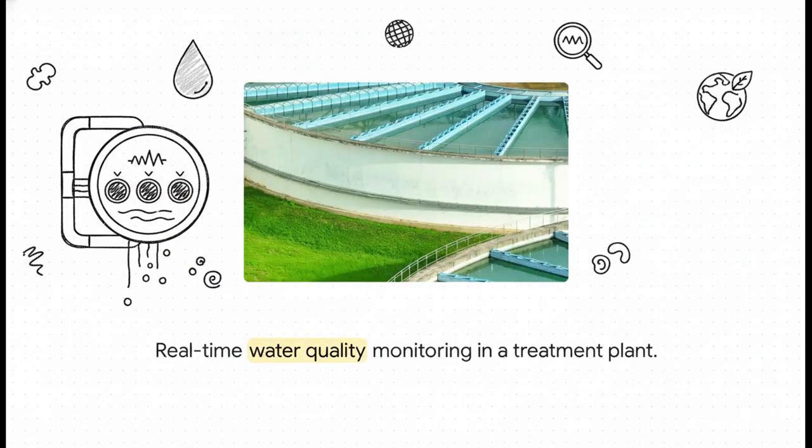Take public health, for example. In a world dealing with climate change and a booming population, safe drinking water is absolutely paramount. Modern water treatment plants actually use real-time UV-Vis spectroscopy straight in the water flow. By using specific photodiode filters targeting exactly 220, 254, and 275 nanometers, these facilities can instantly detect harmful pathogens, monitor cloudiness, and spot organic compounds. And they do it continuously without ever having to haul a sample back to a lab and without contaminating the water itself. It's a real game changer.